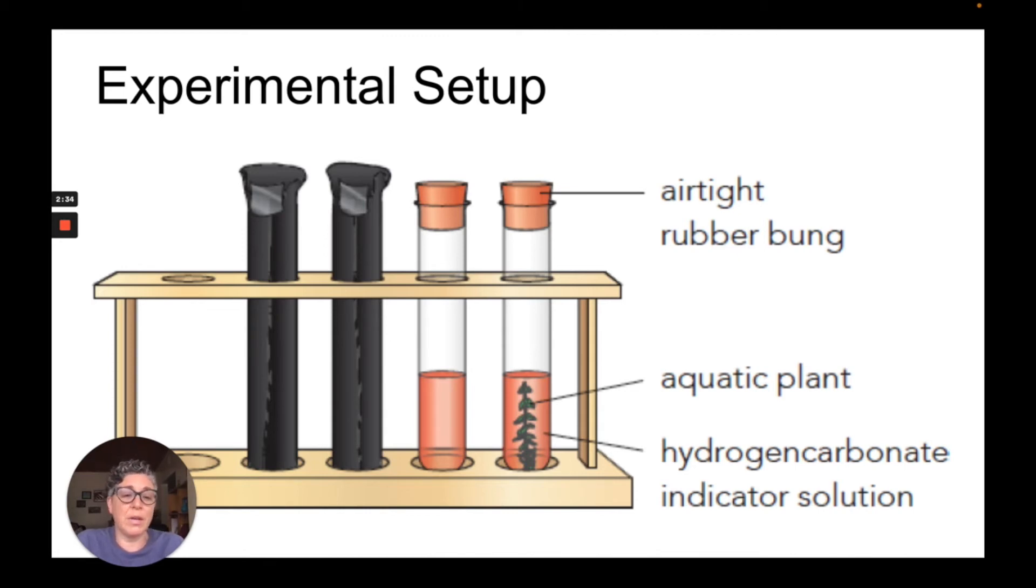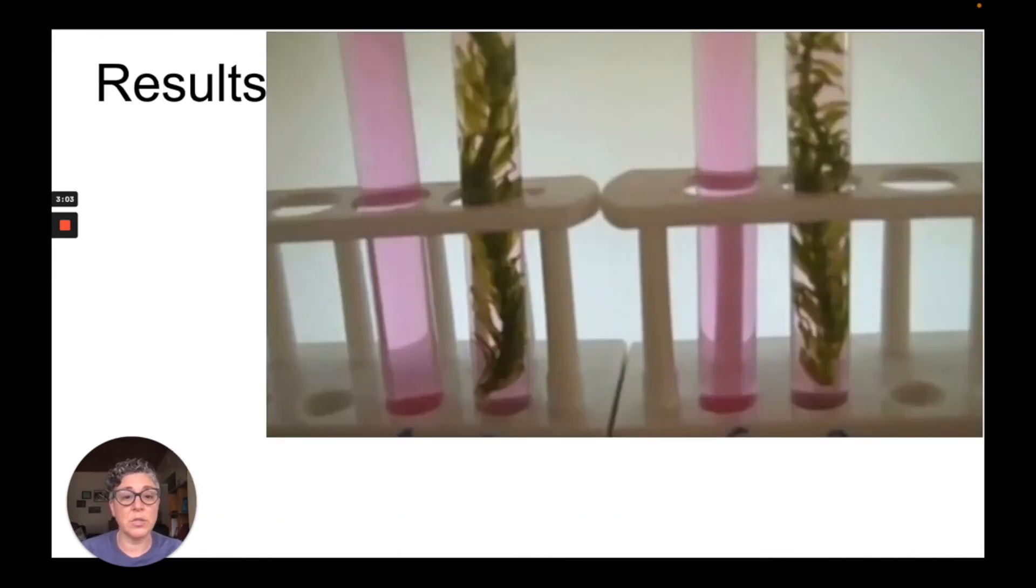One is going to have an aquatic plant and the other one is not going to have any plant in it at all, and both of them will have solutions of hydrogen carbonate indicator in them. The two test tubes under the black paper are going to look identical to the two test tubes under the light. This is left for a period of time and let's see what our results look like.